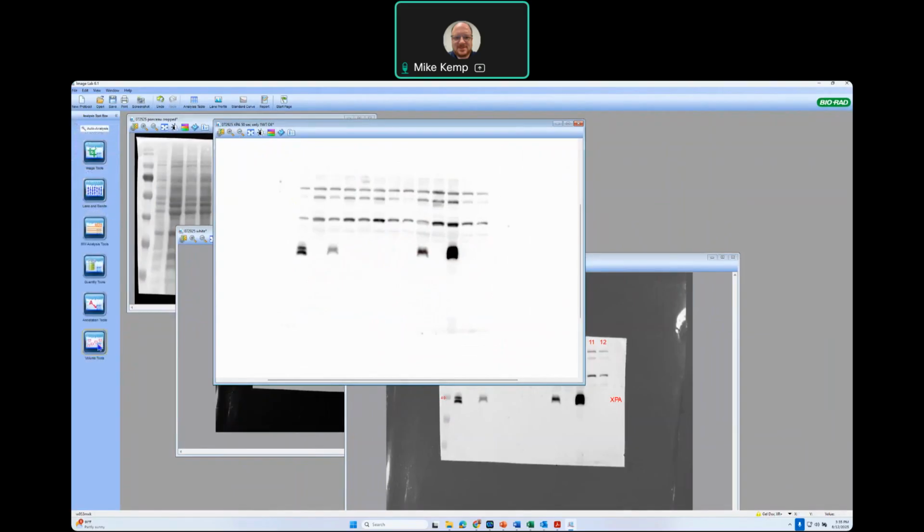And then what we're going to do is use the image quantitation tools. And there's a couple different ways you could do this. I'm going to use the way I typically do. There will be another link to a YouTube video in the ChemLab handbook, with somebody from Biorad showing a more elaborate and more sophisticated way of quantifying bands. Also perfectly good to use if you want to take a look at that as well. So we're going to go down to this volume tools.